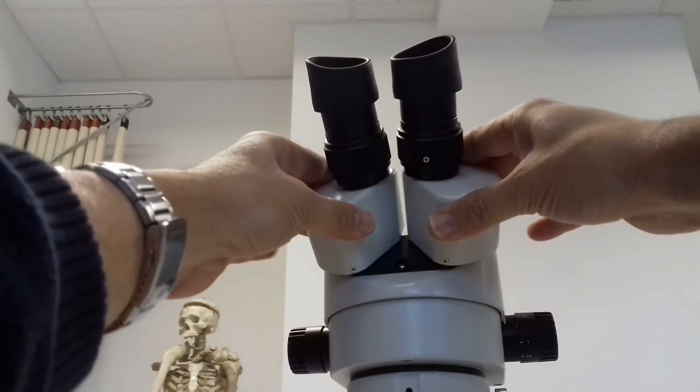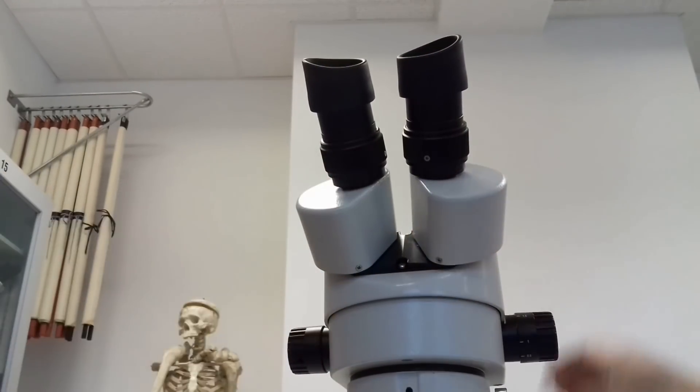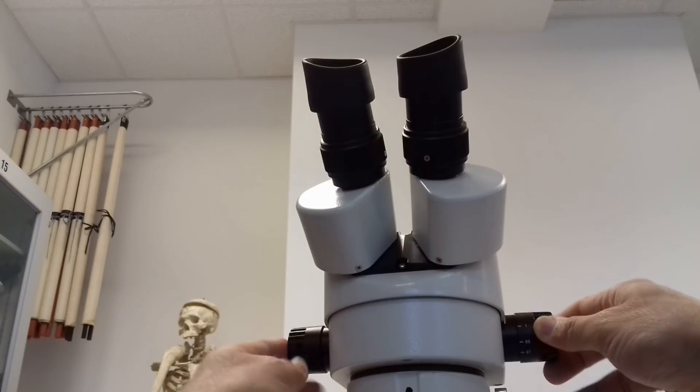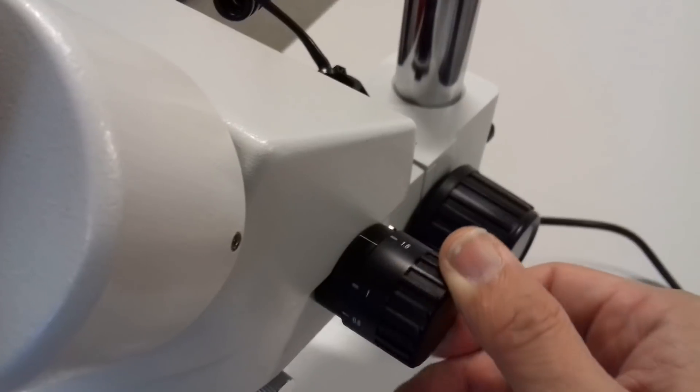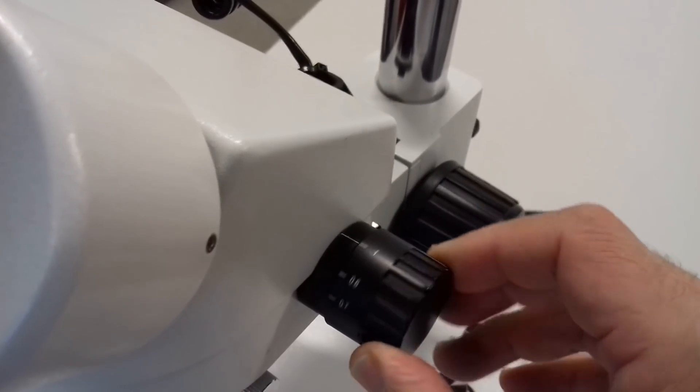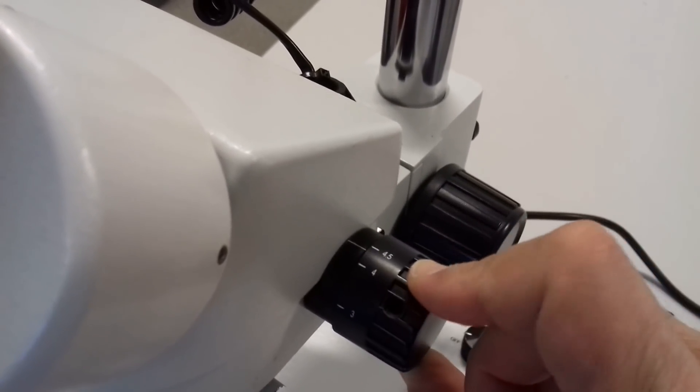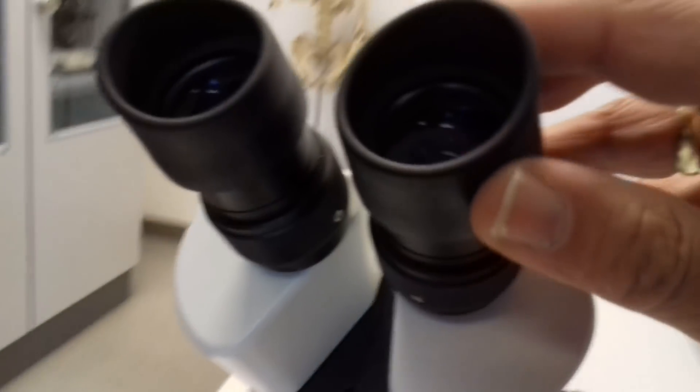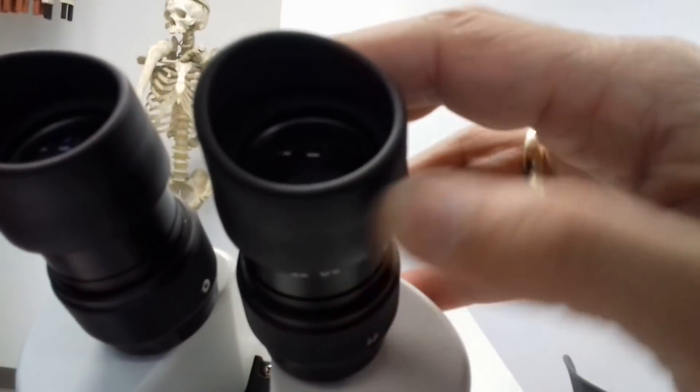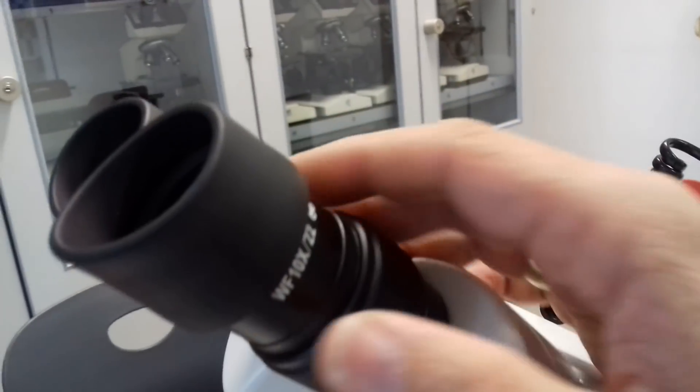That because there are prisms in the stereo microscope which turn the image upright. So that is the zoom function, so I'm kind of turning this and you can actually see that on the outside there is not a big change because all of the optics they move inside. 4.5 multiplied by 10, which is the magnification of the eyepiece, gives you a total magnification of 45.